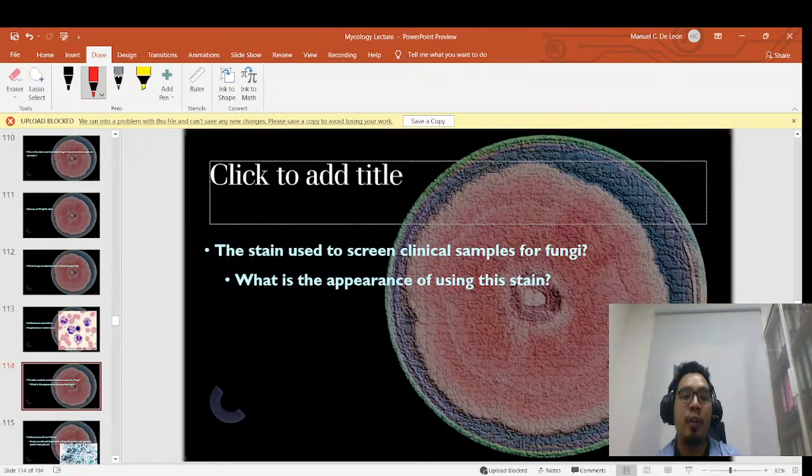All right, now let's move on. Stain used to screen clinical samples for fungi. This is now known for screening samples. Usually, this is done on patients who are immunocompromised, such as those patients in a sanitarium for HIV, AIDS patients. Usually, we want to screen their samples, especially their biopsy samples, for fungus. So one way to quickly do it is make a sort of like a pap smear, but instead of staining it with Pap stain, we stain it with this stain.